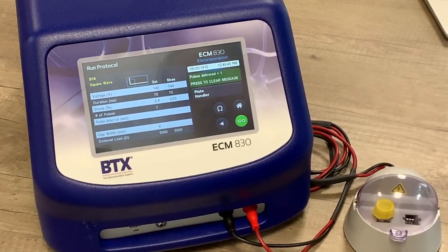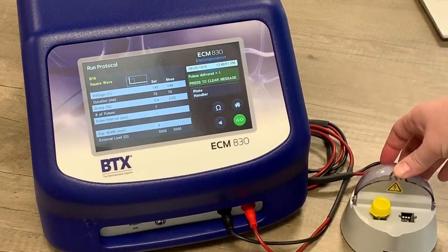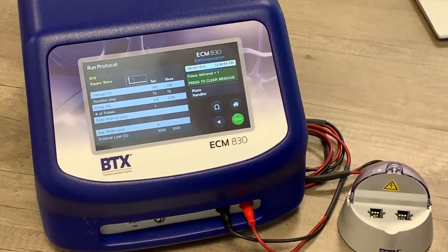You will also get results appearing on the screen to ensure that your electroporation has operated within the parameters that you originally set.